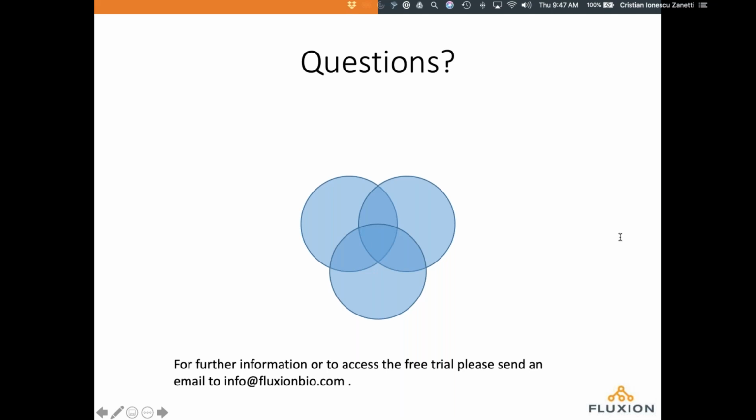There's another question regarding duplicates. Regarding chemistry, what is done differently with the MAPS rather than running duplicates of your cfDNA sample? The answer to that is we've introduced MAPS as a concept for error elimination. Essentially, what we're doing is running technical replicates. If you run technical replicates, that's similar to running MAPS. And that data can be fed into the RACI caller and used with the same kind of statistical approach.